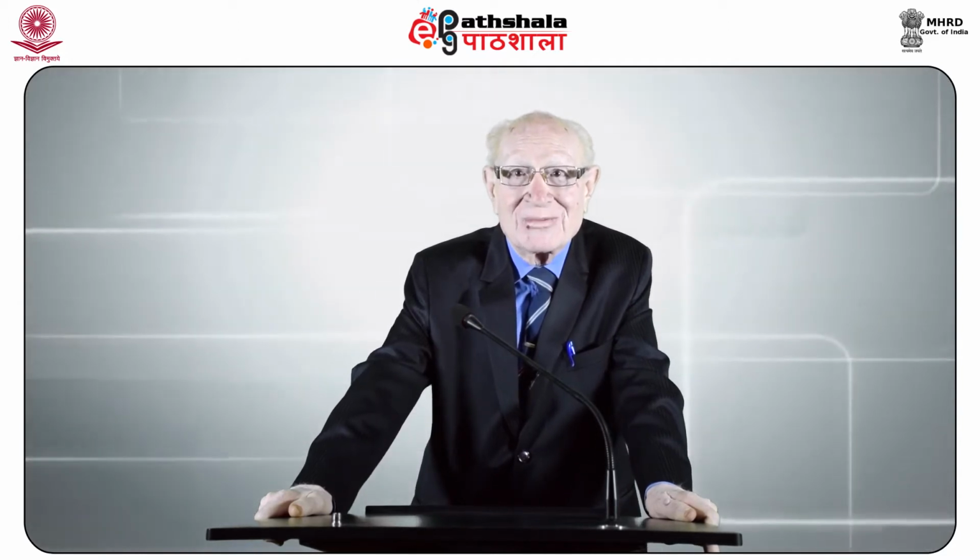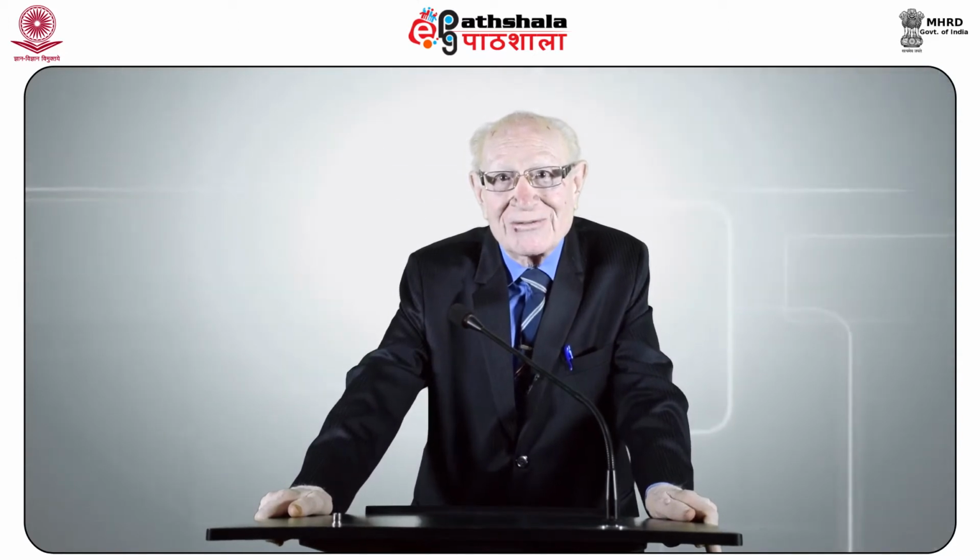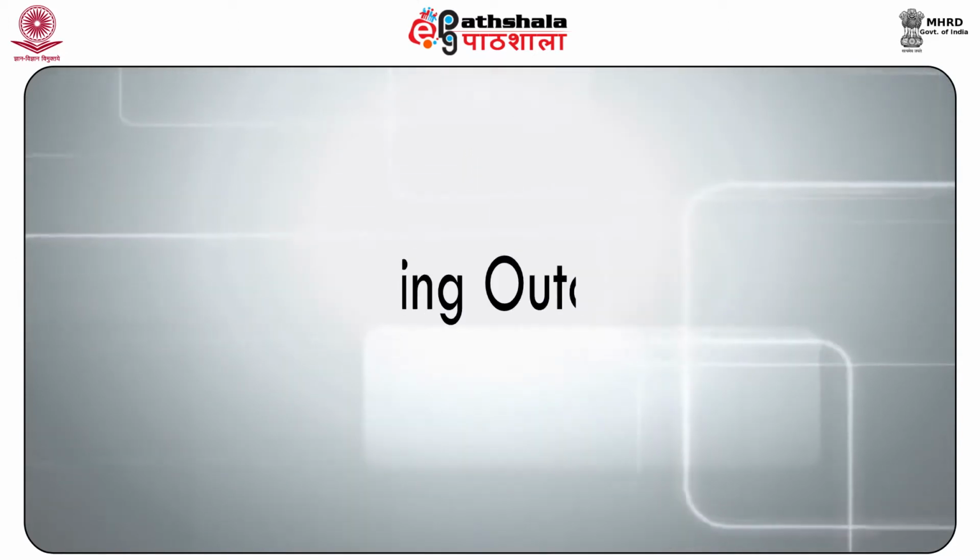Hence, it is difficult to maintain such a costly apparatus. It requires a lot of space and also requires huge maintenance cost. That is why it is not normally used by many laboratories in India. But this is one of the best methods if we can have the gold coating of the GSR particles.